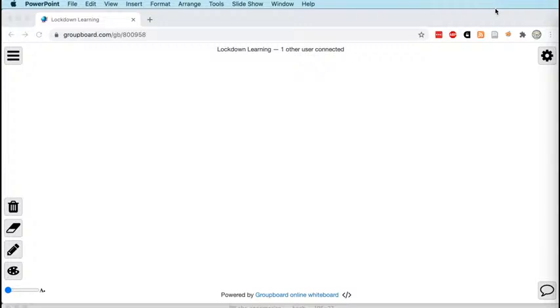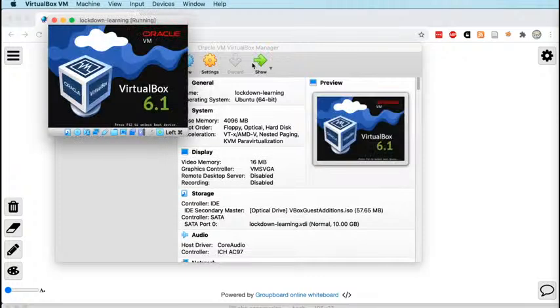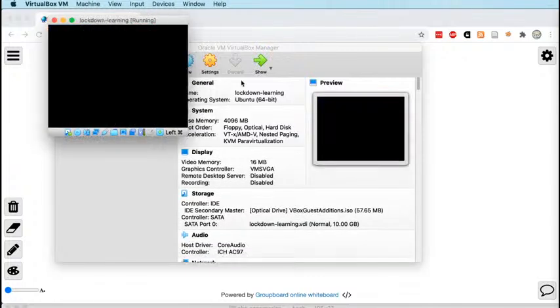So we're going to work with our E. coli reads that we looked at earlier on in lockdown learning. So I'm going to bring up my virtual machine. I'm just starting VirtualBox. And let's take a look at those reads and figure out if we can estimate a value for k for assembling this genome.